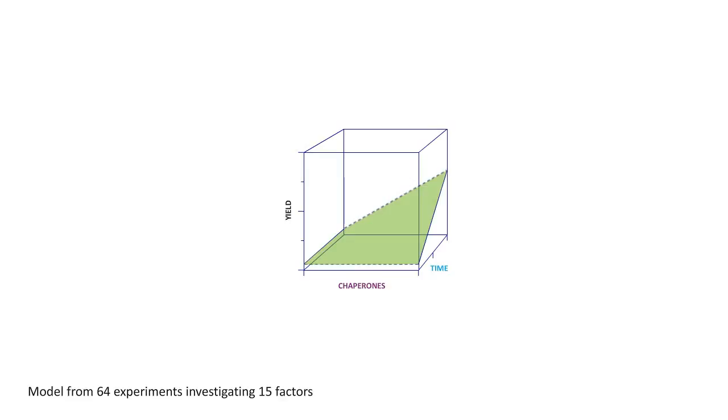Unpicking that two-factor interaction, though, is just the start of your journey, because it turned out once we had moved to the right part of the design space, there was in fact a three-factor interaction going on in this biomanufacturing process between genetics and environment.